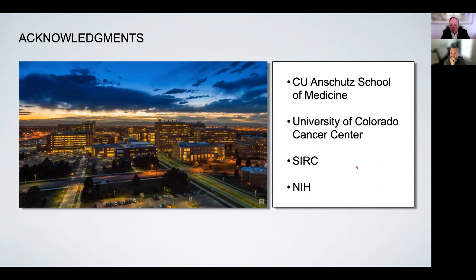So for example, in stain, we end up using very, very low concentrations. In cryo, the concentration of particles that you need could be much higher, up to perhaps a mg per mL. And there are ways of manipulating sample preparation that will allow you to get around KD limitations. But basically, the bottom line is size and stability of the two interacting partners.